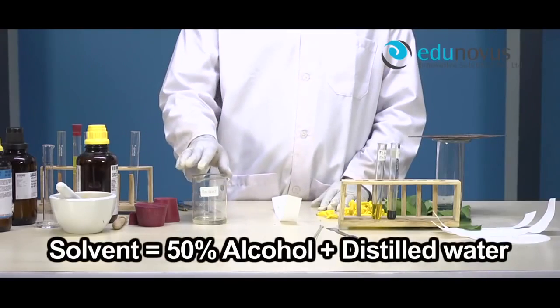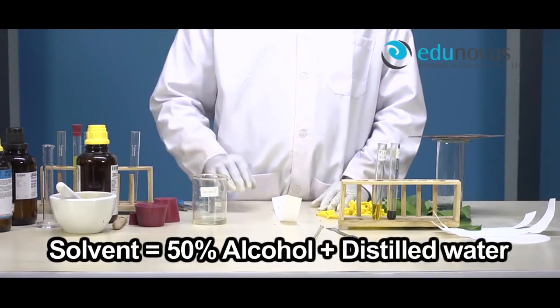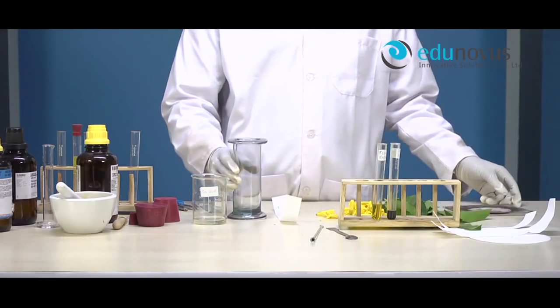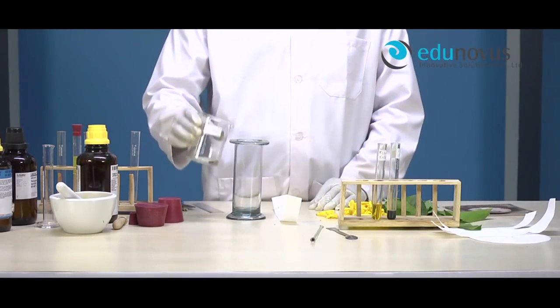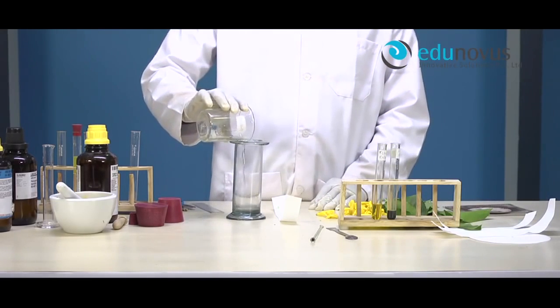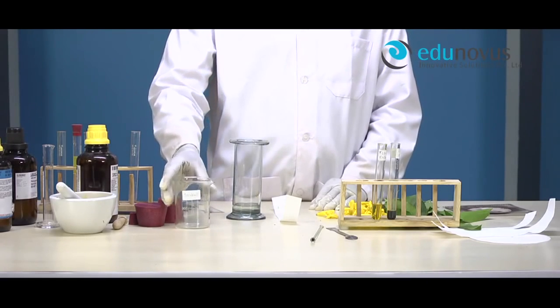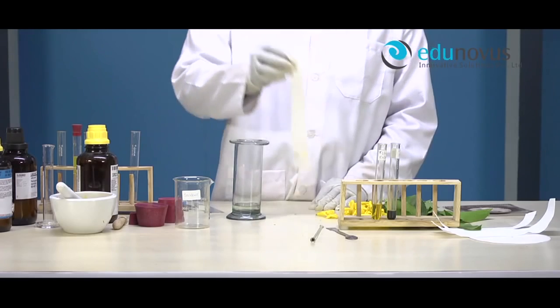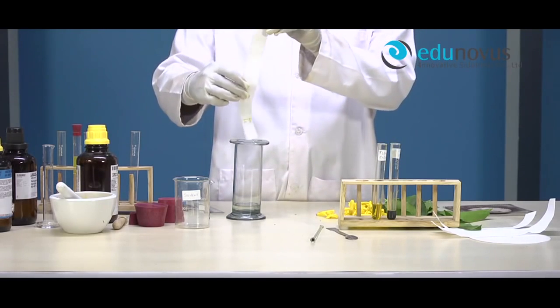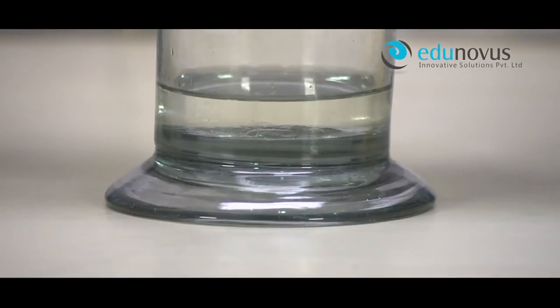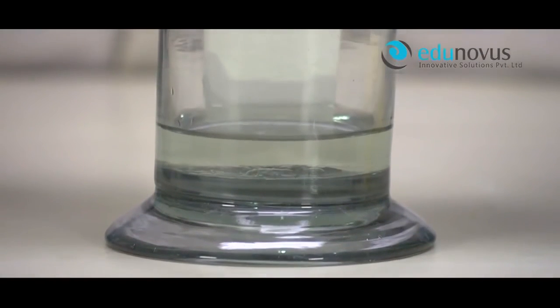The solvent here is 50% alcohol and distilled water. Transfer the solvent into the glass jar. After that, suspend the filter paper vertically in the glass jar in such a way that the baseline remains above the solvent level.